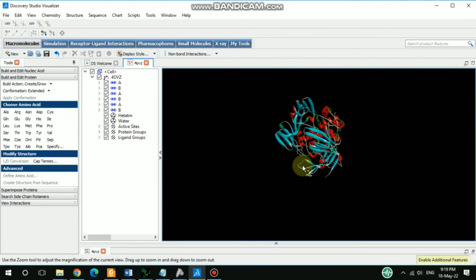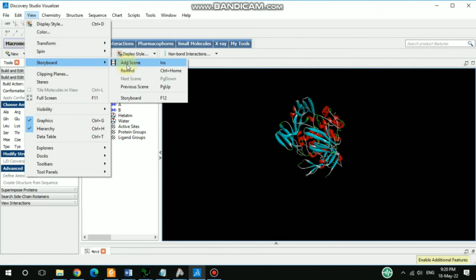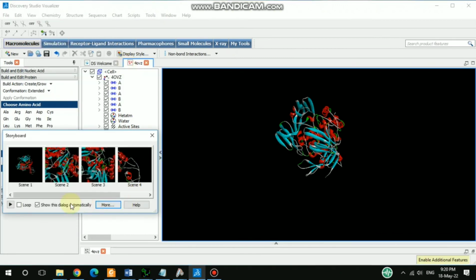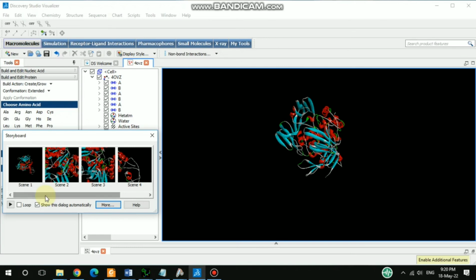Okay, so this step also I want to save. Then you can save it. So you see here how many scenes are there now? 5 scenes. Okay, right.